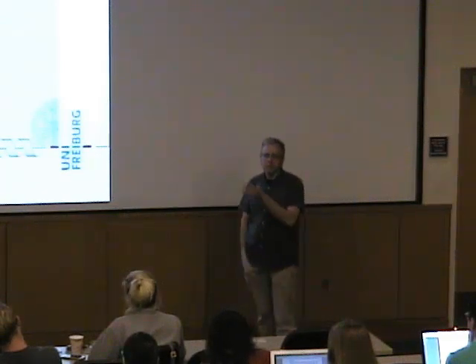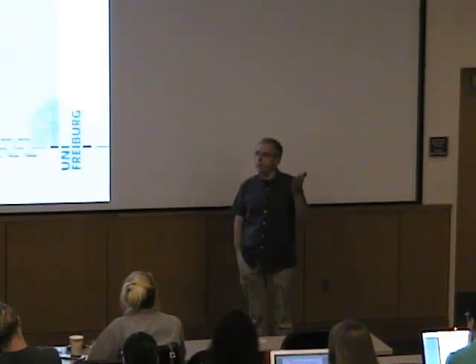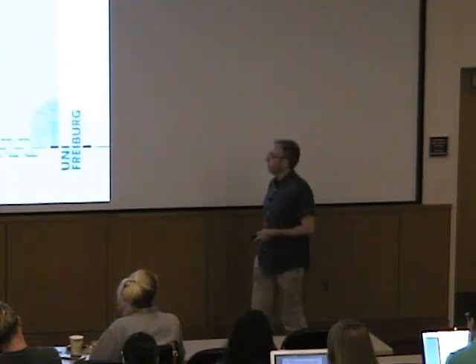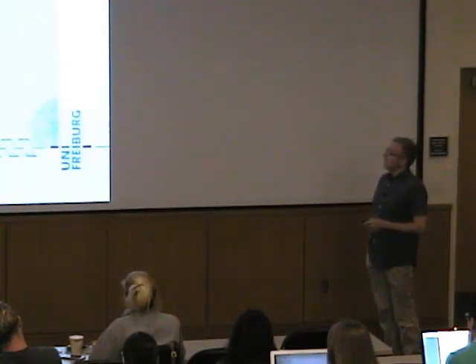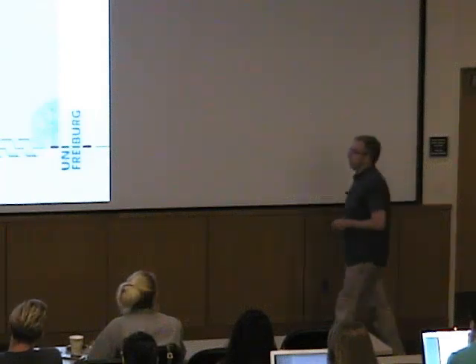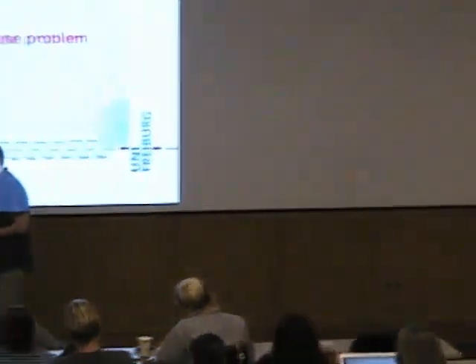There are many ways how you can explain this, but bottom line is we cannot measure phase angles. We couldn't, even if our devices would allow us, because we're not using coherent X-rays at that point, so we don't know the phase angles of this whole stuff to start with. And of course, they're not coordinated upon diffraction. So we can measure amplitudes, but we cannot measure phase angles, period. This is the phase problem of crystallography.